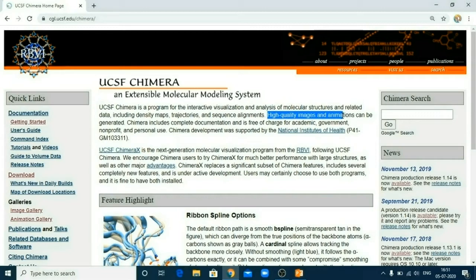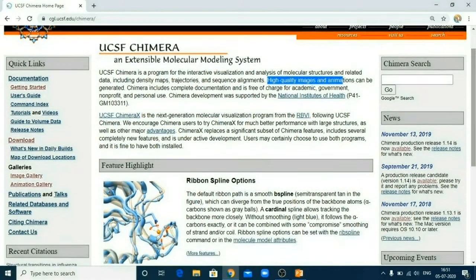So friends, what I call UCSF Chimera is a two-in-one software. That is, the first purpose is for analyzing your results, and the second is for visualization. So friends, let's see what you can do with this UCSF Chimera.